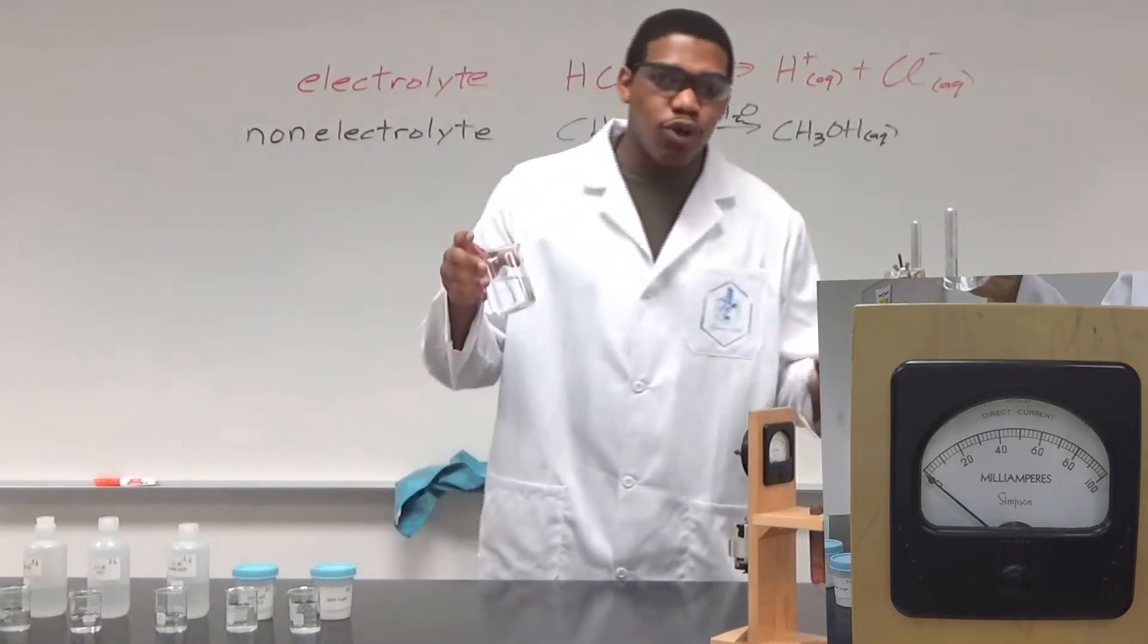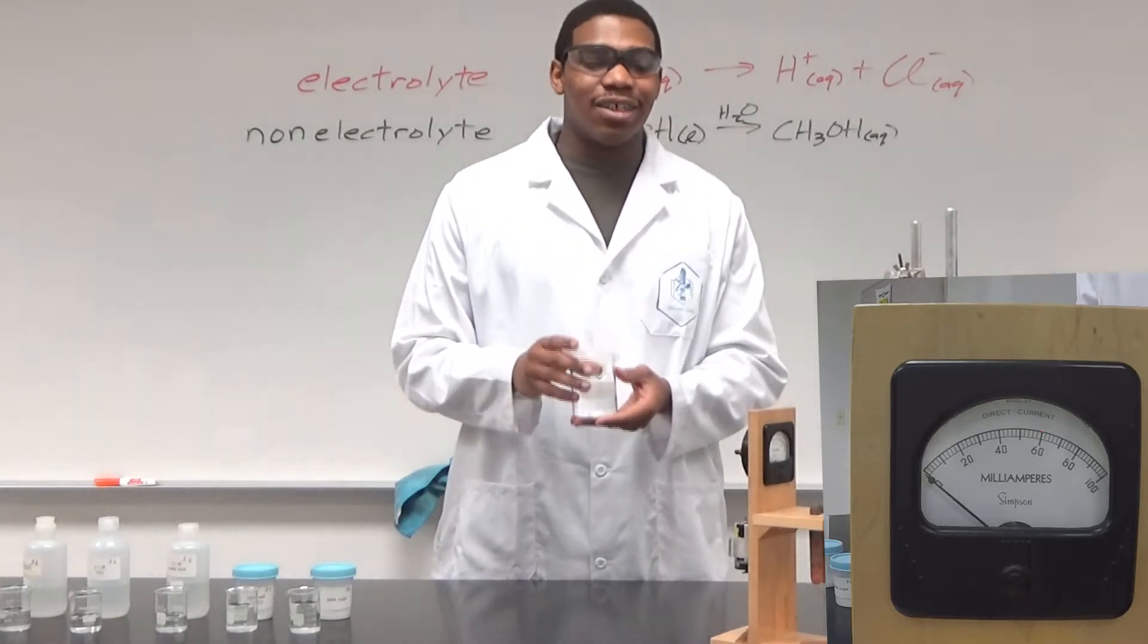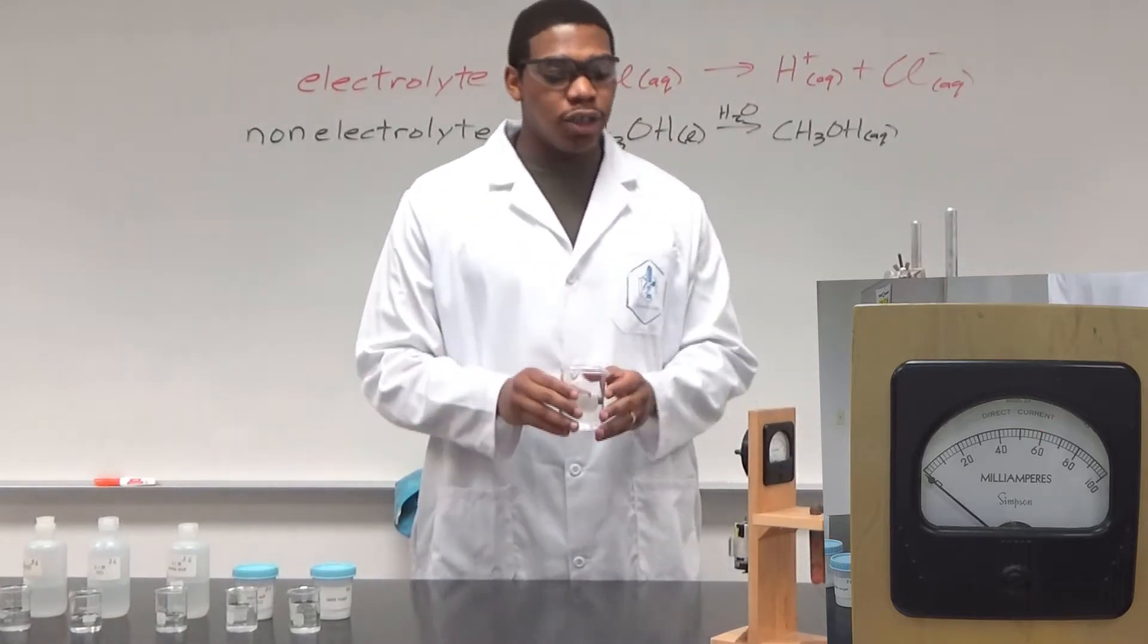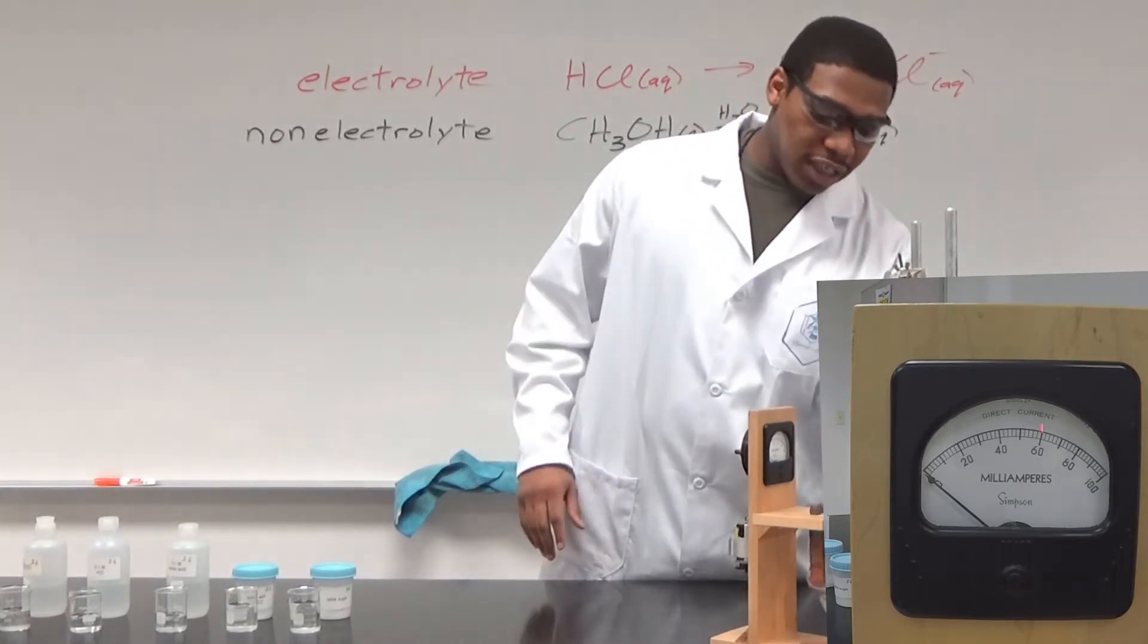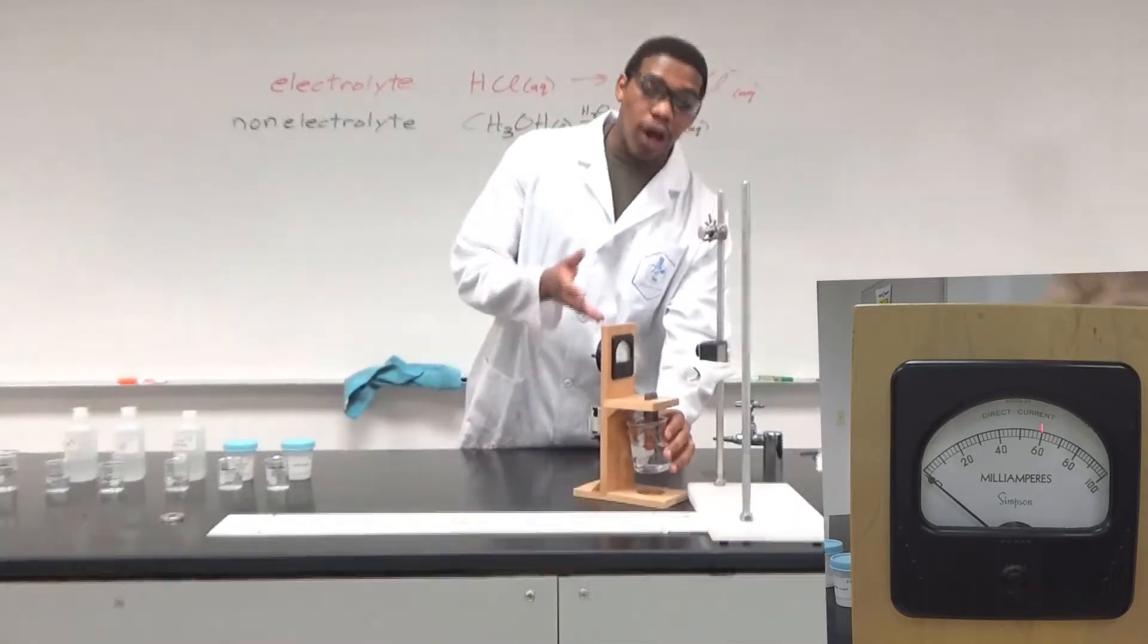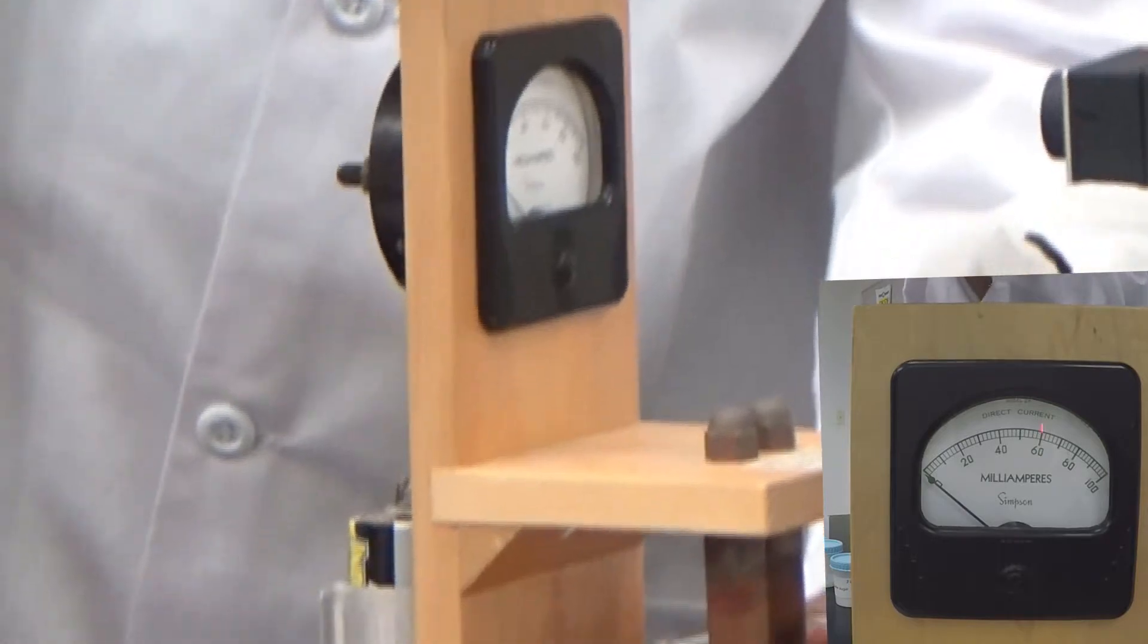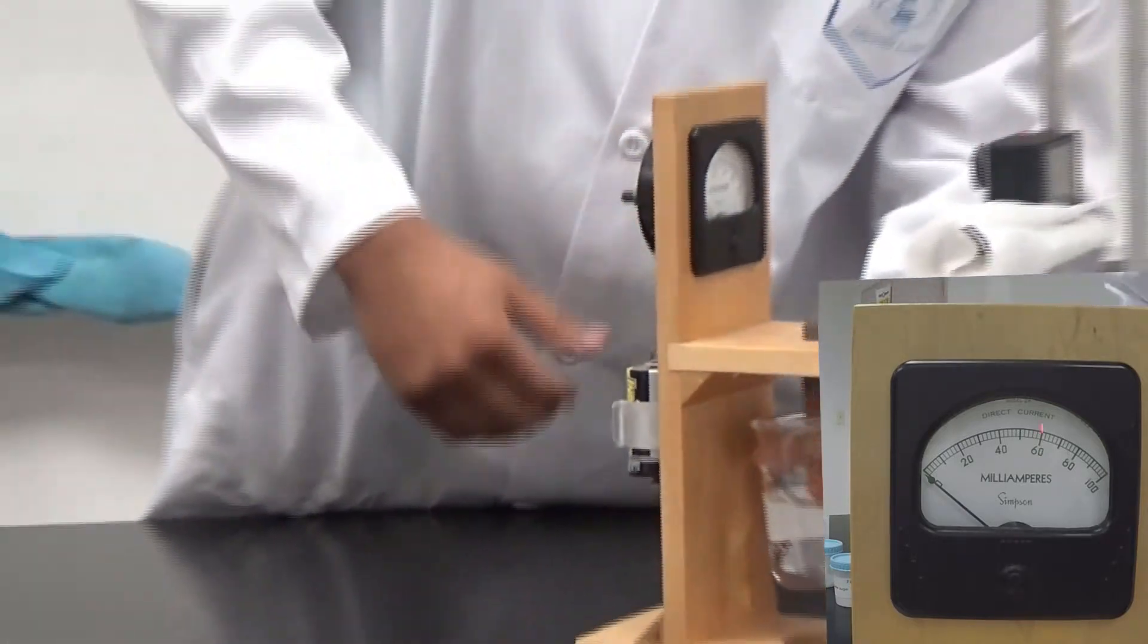We're going to start with normal DI water. There's not really any ions here - it's filtered water so we can maintain its pure H2O status. Let's put this water into this conductivity meter. On the top, what you should see in the camera is a meter that can let you know if the solution is conductive or not.